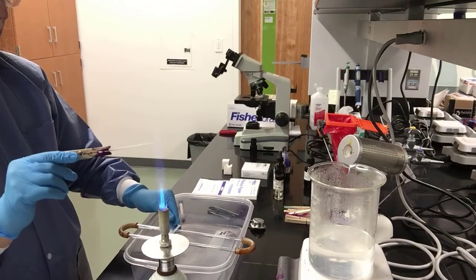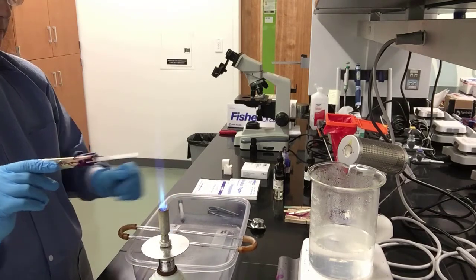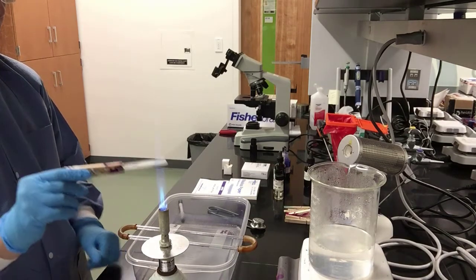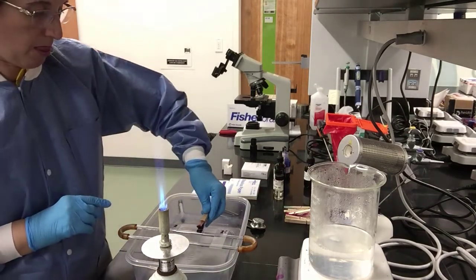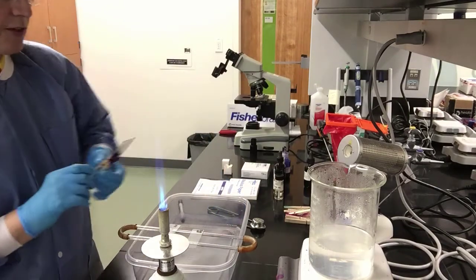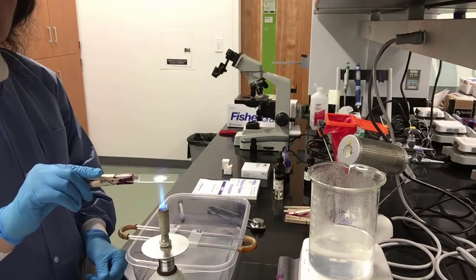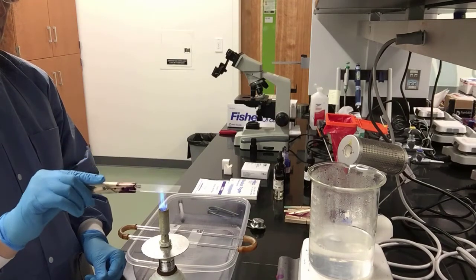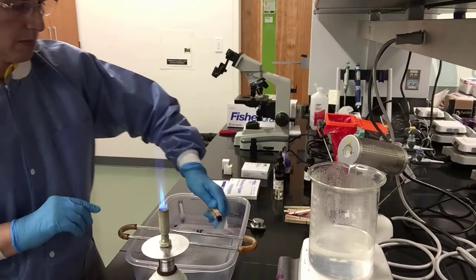Pass it over the flame once, twice. Now we don't want to heat fix them too long because we also have those mycolic acids, so we don't want to melt the mycolic acids. We want to preserve them to the best that we can, and that's why we're using steaming water for the moisture, mainly in the steam.